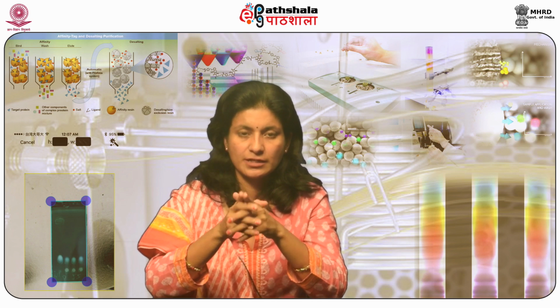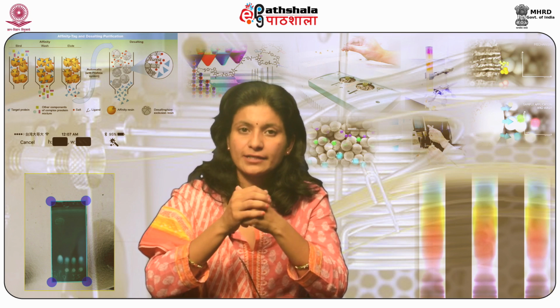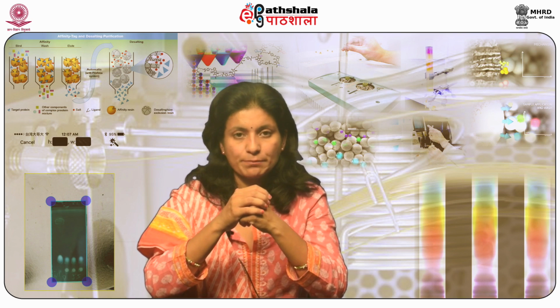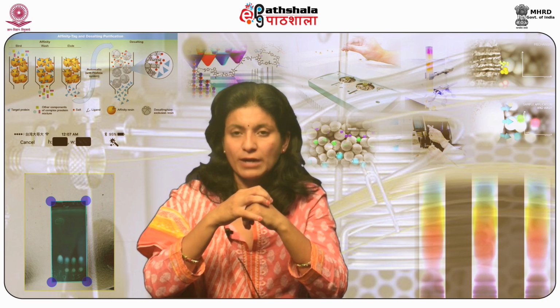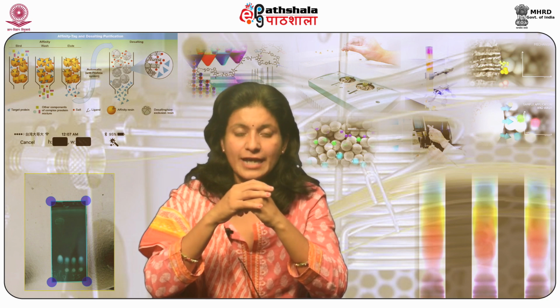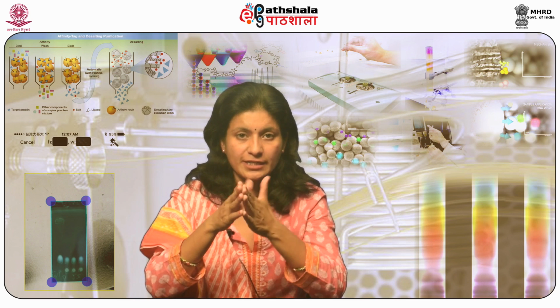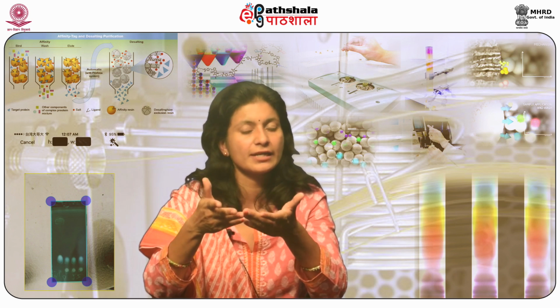Bioactive natural products. These products are the chief source of functional foods, food additives, and new types of drugs. They consist of secondary metabolites, for example, alkaloids, sterols, flavonoids, etc., in animals and plants generated through biological processes. IEC is one of the most often utilized techniques for the separation of natural products in pure form. It is the core fundamental and efficacious technique as it is inexpensive and offers high recoveries of key analytes.